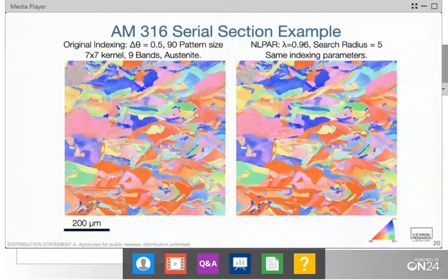Peter Kronenberg has a question of how I am remapping the orientation data, and how I am dealing with interpolations and those types of things. Very good question, Peter. There's two things. The first part of the answer is the disappointing one. I'm using nearest neighbor resampling. That's how I avoid having to figure out how to interpolate. I don't. I just grab the nearest index point.